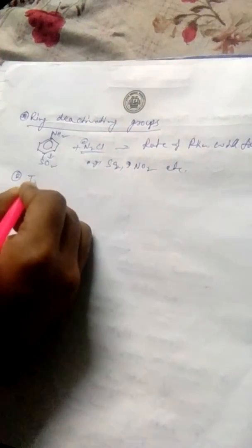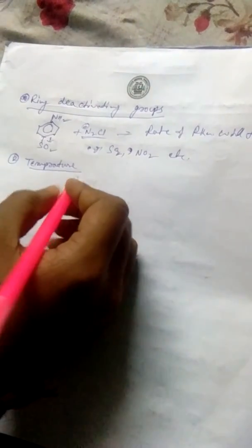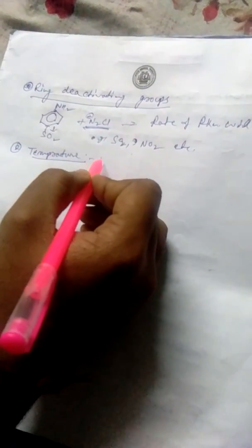And the second point is temperature. Temperature is a key factor in this reaction, because the diazonium salt is stable only at low temperature.